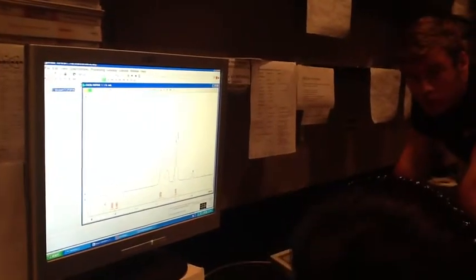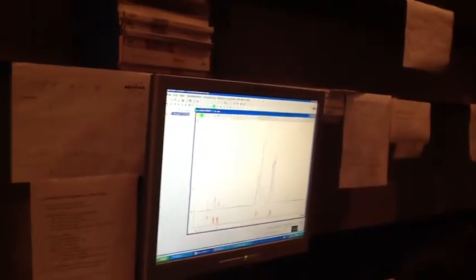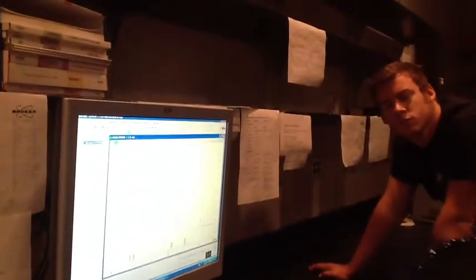So instead of heights, we're looking at integrations, right? The areas, just like you did in your GC. Yeah, so that's 1 to 0.5. So it's half. The integration is the area of the peak. Okay, so it doubled in height, so is that what you're asking? So 100% to 50%? Width times half height.